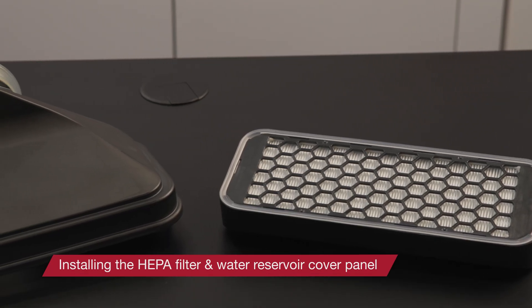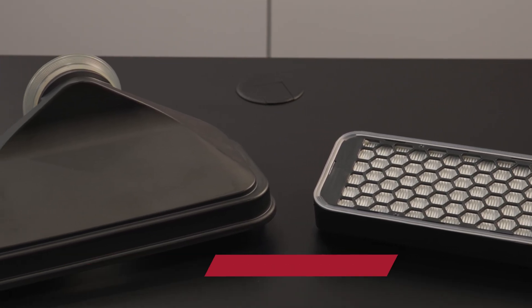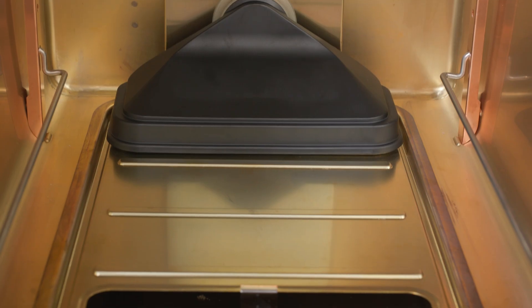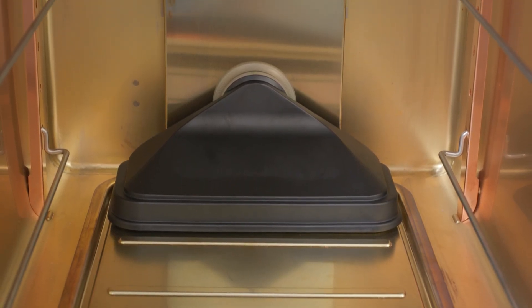The HEPA filter and water reservoir cover panel must be inserted into the air box from below. To assemble the HEPA filter and air box, start by placing the HEPA filter on a flat surface.